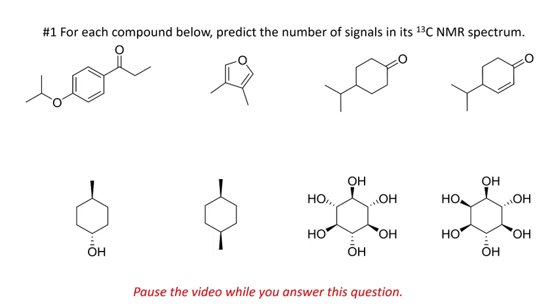Okay, we're back. Let's see what we've got here. In this first case, a CH3 next to a CH2 next to a carbonyl group. Don't forget that carbonyl group. Carbon here with no hydrogens. 2 carbons flanking that. 2 carbons next to those. The final carbon in the ring next to the oxygen. A CH and 2 CH3s. 1, 2, 3, 4, 5, 6, 7, 8, 9.